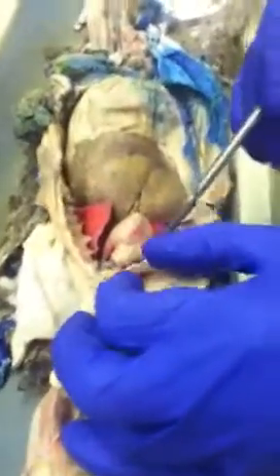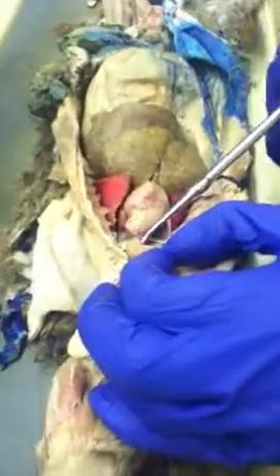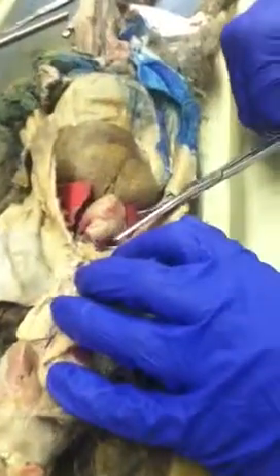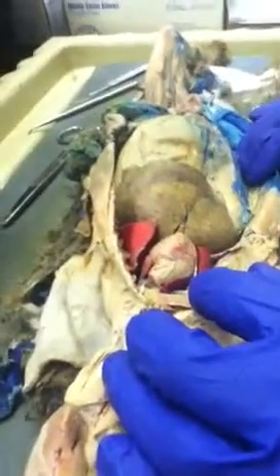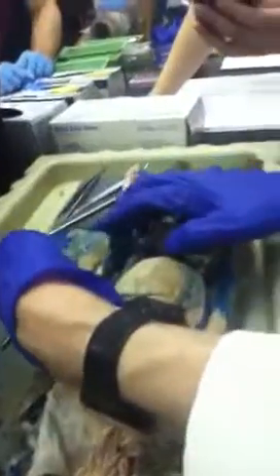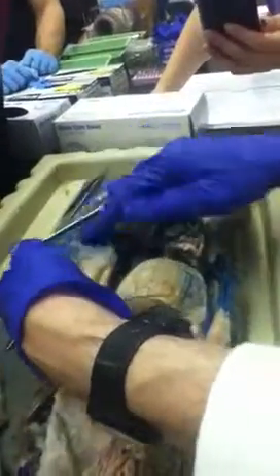Okay, this is thymus gland here, and I'm going into the pericardial sac. I'm busy damaging it because I need to see what's what. Now, whenever you're looking at an organism and you have internal organs and body wall, remember the surface is called peritoneum. That's a sheet of cells, and actually in here the latex seems to have gotten between the peritoneum and the muscle, and it was just a mess.